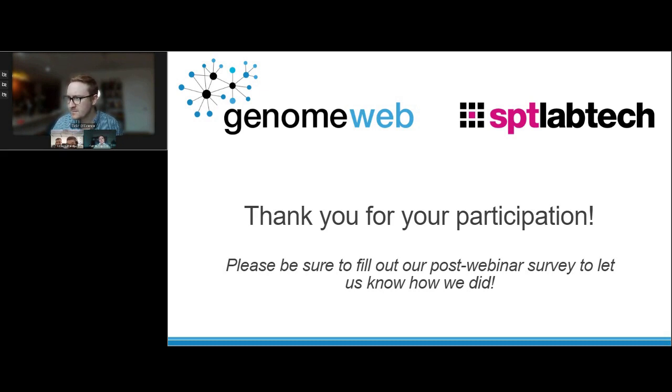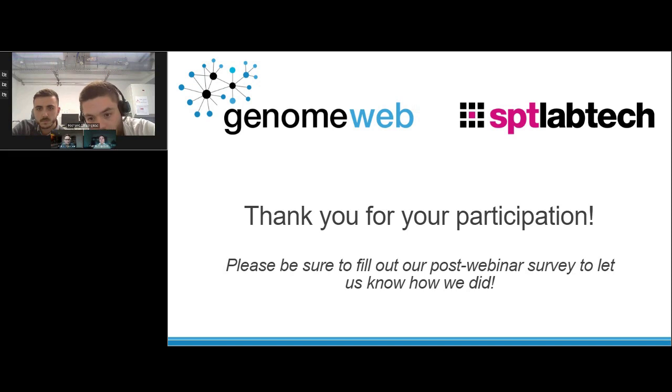Okay. So for now, we do not worry about the optical contamination, but the NovaSeq is able to deal with a lot more samples than we are currently using. After that, it depends on the flow cell that you use. As I said, we could upgrade the flow cell or the indexes that we use for the routine. But for now, we haven't had any issues saturating the Nova with too many samples. For now, it did not happen in the lab.